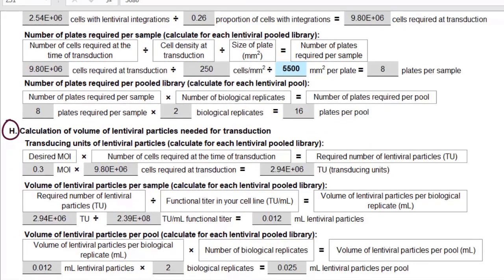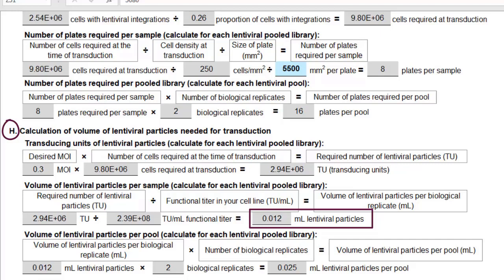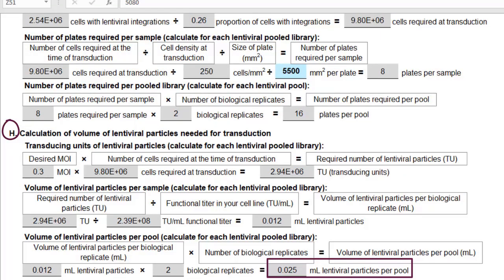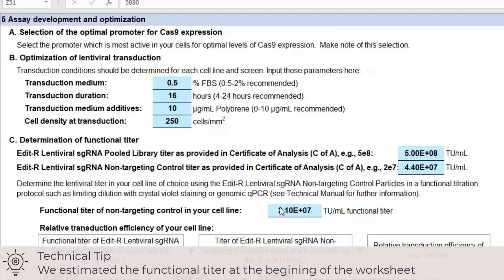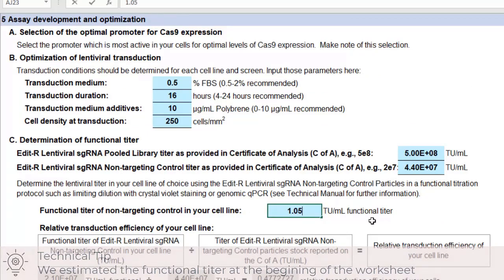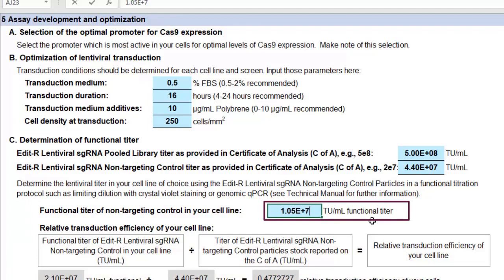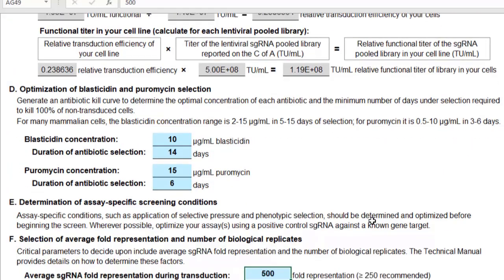Now onto section H. We will continue with the smaller proteases library, which has one pool of 5,080 constructs. The tool calculates how many transducing units we'll need and how many microlitres of lentiviral particles that will be, taking into account the functional titer. For our two biological replicates, we need 25 microlitres of lentiviral particles. If the functional titer of the cell line is lower, then we need more lentiviral particles. We estimated this value at the start of the worksheet, so it is important that you put your experimentally derived functional titer into the worksheet to ensure that you are transducing your cells with the appropriate volume of virus.